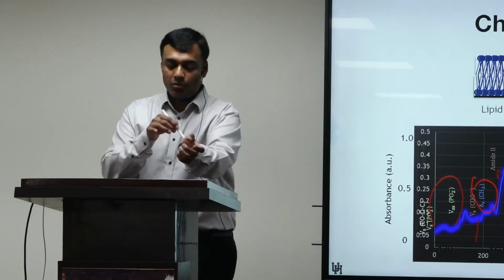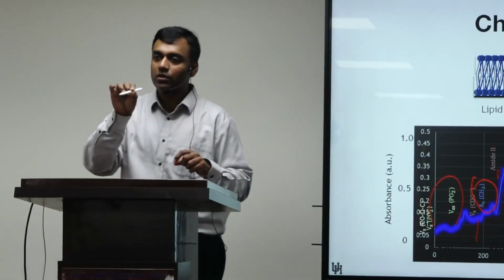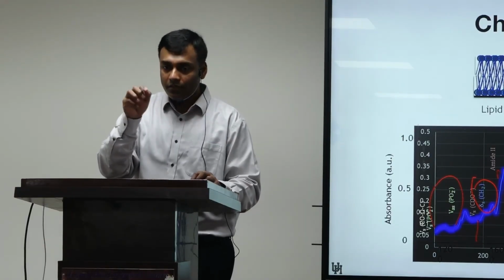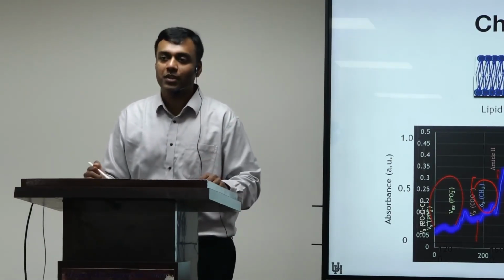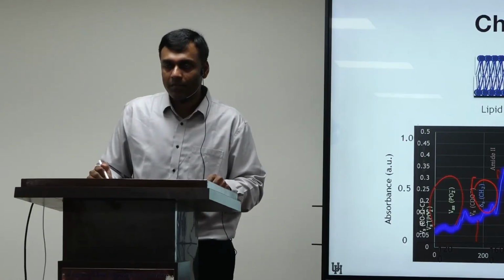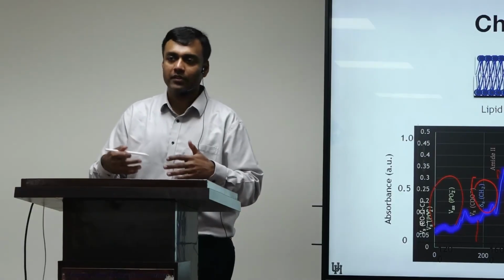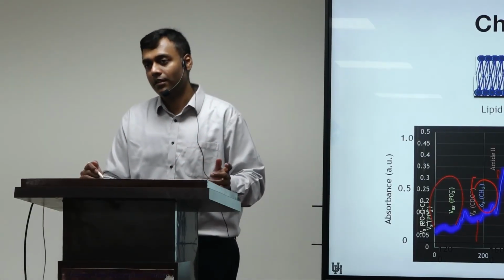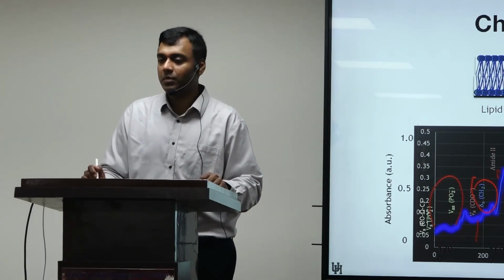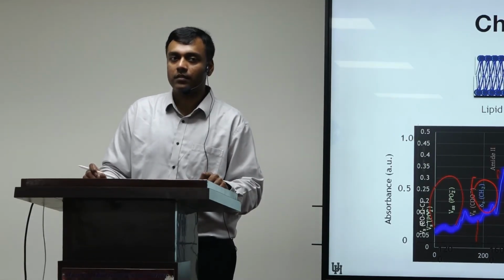One of the things is you have to put a needle in, say if you're suspected of breast cancer, go to the location where there is a lump or something of that sort, take a sample, put it under this instrument and do the measurement. In the future, we hope that we will get to what you're saying. But as of now, it's in the stages of development where you have to actually look at it after you take it out. That's one of the things which people are working on. That's a good question. Any other questions?